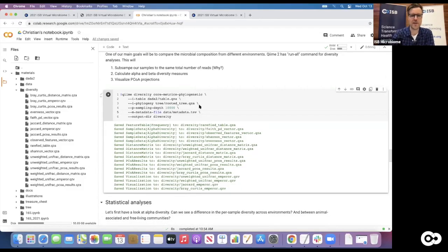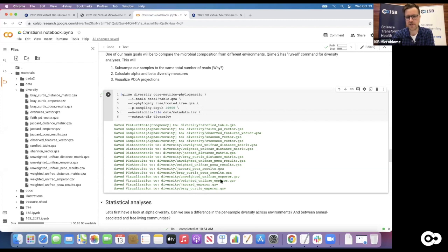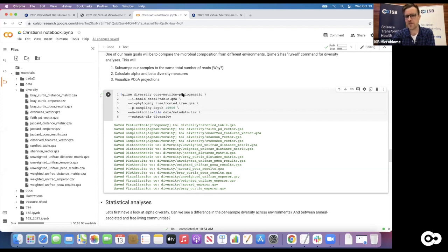So we kind of ended on a bit of a cliffhanger - we generated all that cool output. As you might have seen, the command finished in a few seconds and generated a lot of output files. Among them we can spot a few visualizations which are those QZV files. Those would be super interesting to look at, but we haven't really talked that much about beta diversity and how to visualize it, so let's get a grip on that first.